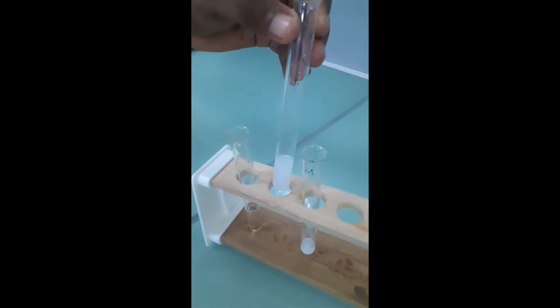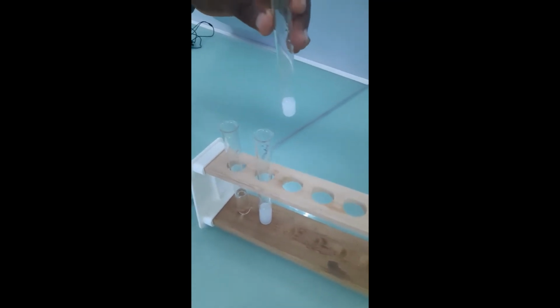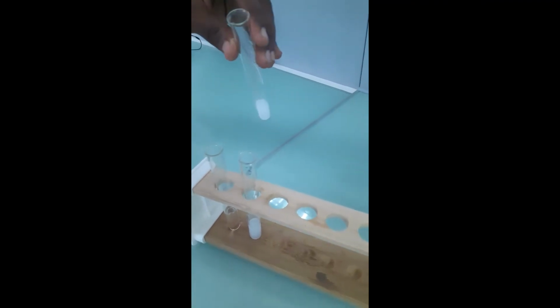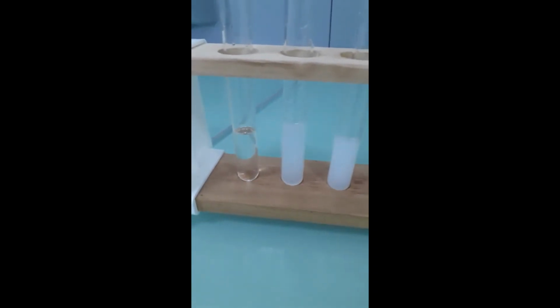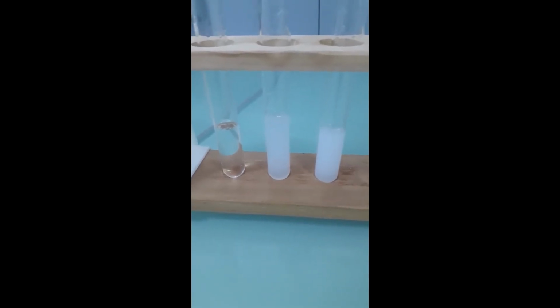So that's the sulfite. Next we will do the sulfate. Okay, so there you have it. From your extreme left, the carbonate, then the sulfite, and then the sulfate to your right. So please take your observations.